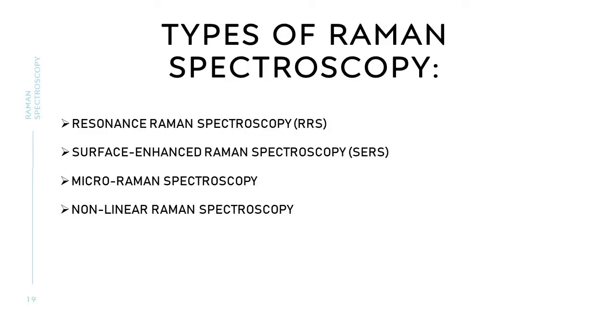So now my second group member Dayanand Meghwal will tell you about the variations in Raman spectroscopy. Good morning, sir. Sir, basically there are now more than 25 different types of Raman spectroscopy, and here we are going to cover some special cases of the Raman spectroscopy variations. The first one is resonance Raman spectroscopy, which is used to study free radicals and biological materials.